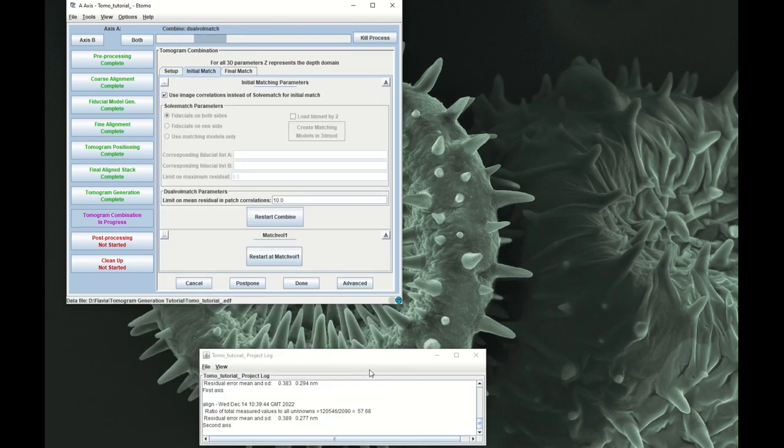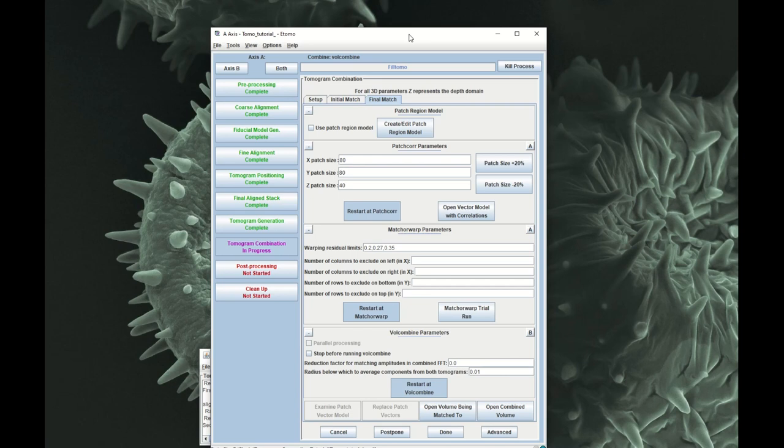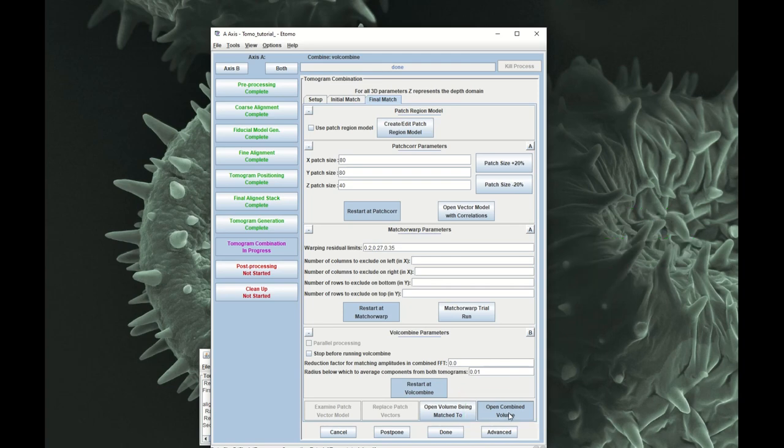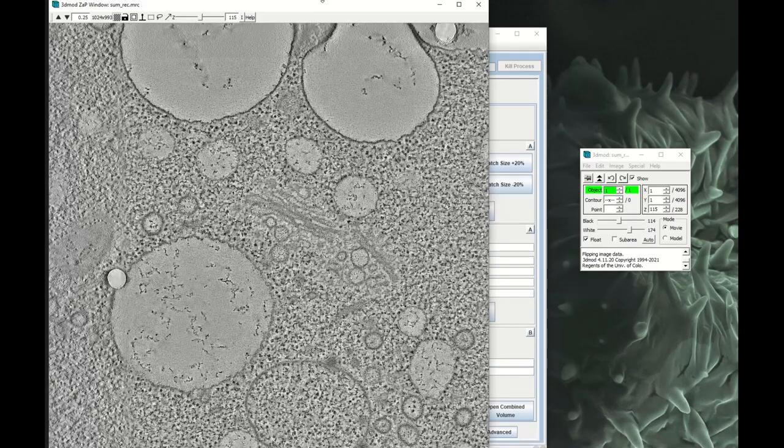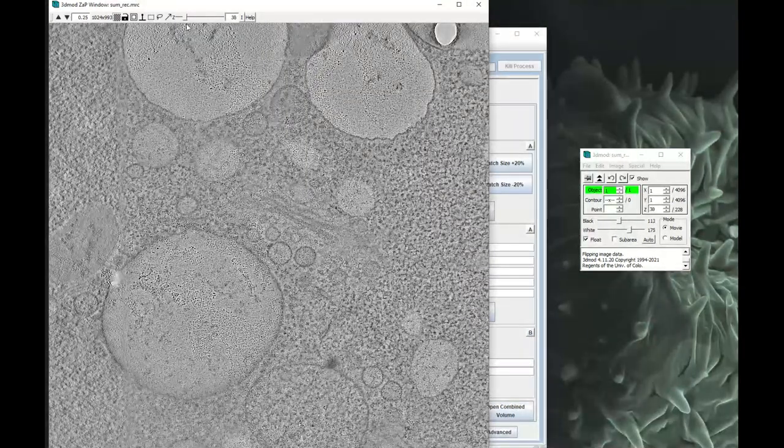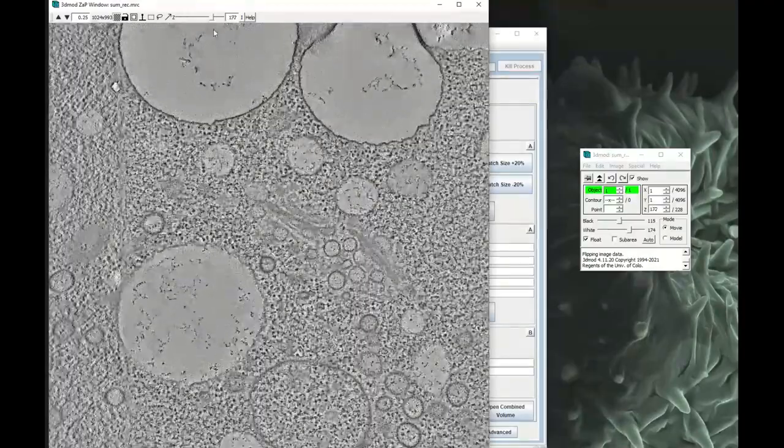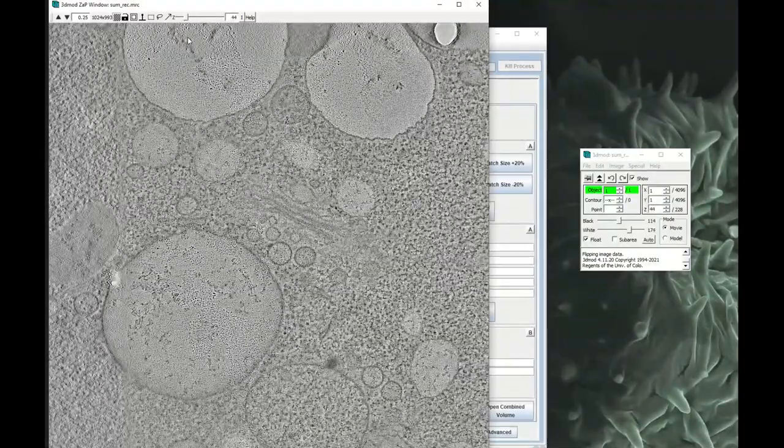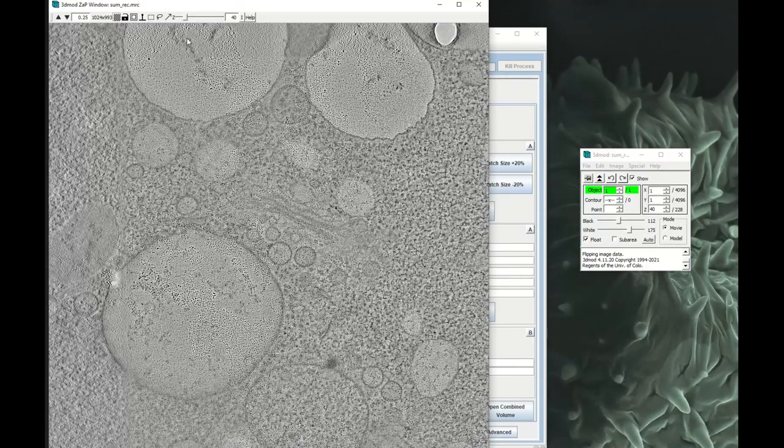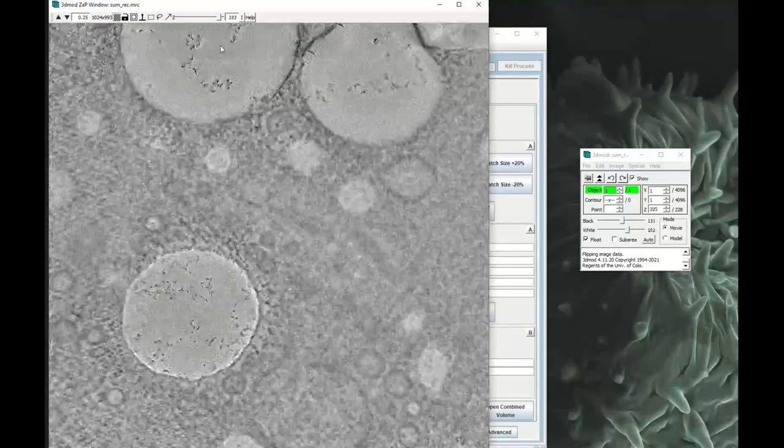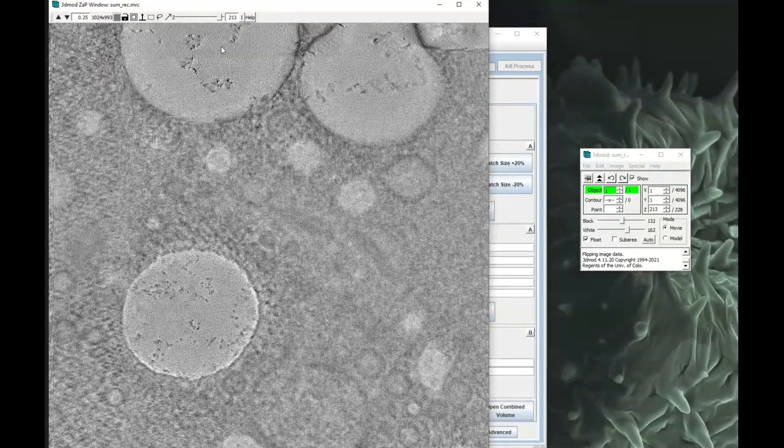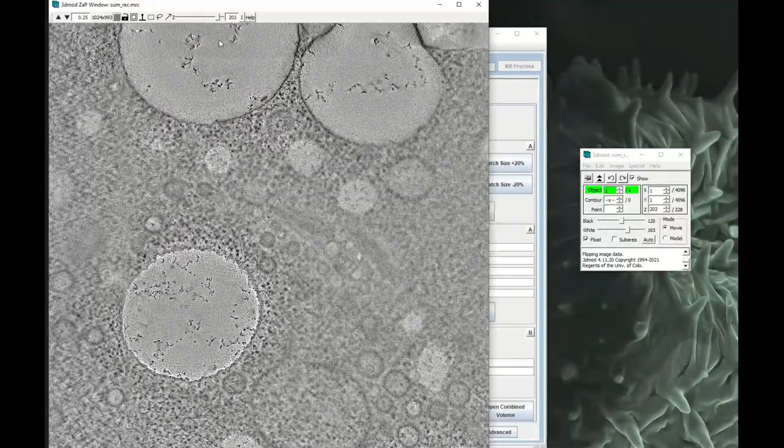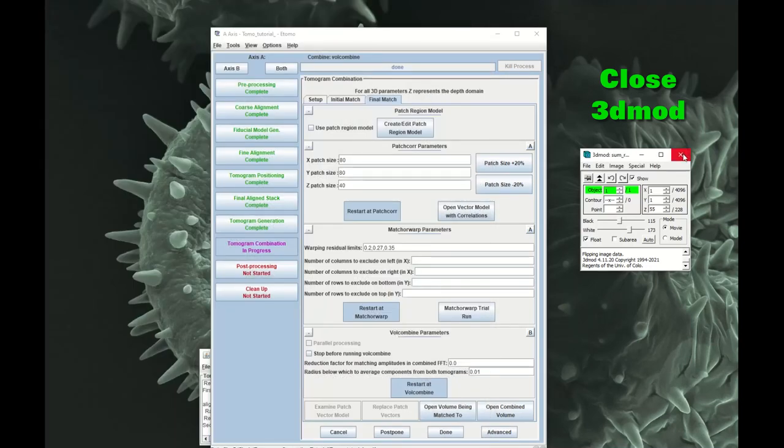So it looks like it's done. Let's open the combined volume and have a better look. So now we've got our tomogram. It looks good. I'm already going to look now at what sections actually have information. So I would say 40 to 210 have information. So just keep that number in mind, 40 to 210. And then when we trim the tomogram we can trim to that. So let's close it here. And then you go to done. Click on done.